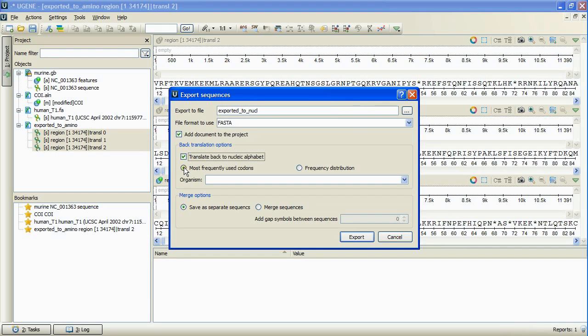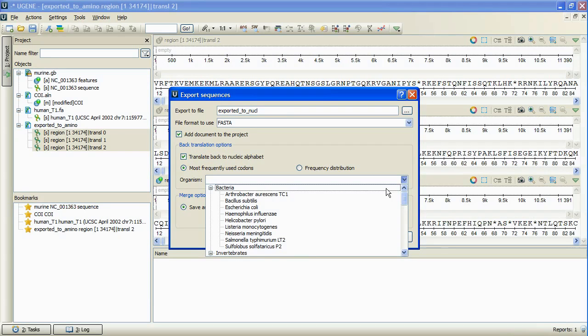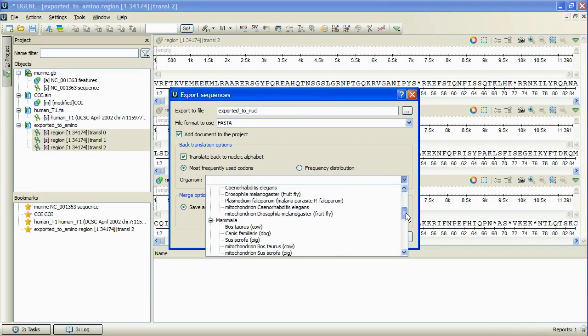We can choose between the most frequently used codons and frequency distribution translation schemes, and select the organism to take the frequency table from.